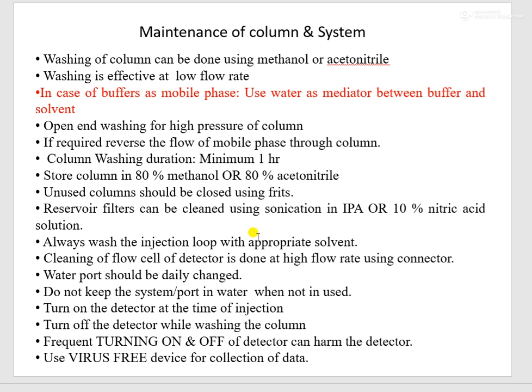Always wash the injection loop with appropriate solvent. If you are going for a manual injector, or if you are going for an autosampler, you have to wash the loop with appropriate solvent.